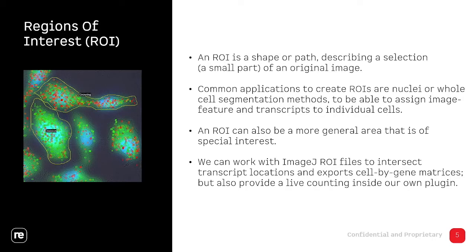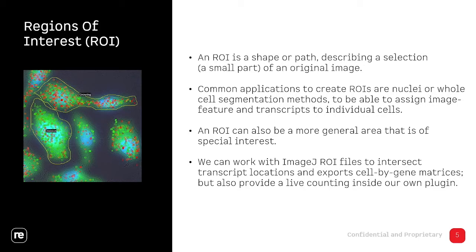The most important part is that we also integrate the region of interest manager and we can import and export regions and the intersect of the transcript, the cell by gene expression matrix. Our tool also provides a live counting of regions, so the expression content of a region is displayed in real time.